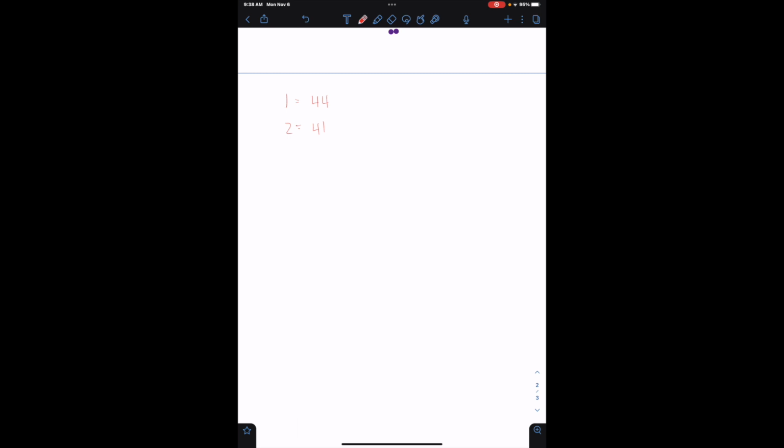And so the very first thing we have to do is see if they agree between sides. So what is our percent difference between sides? And depending where you work, how many cells you've counted. In our lab that we did, it was less than 20%, or plus or minus 5. Let me fix that. Plus or minus 5. So we are plus or minus 5, so our counts are good between sides.